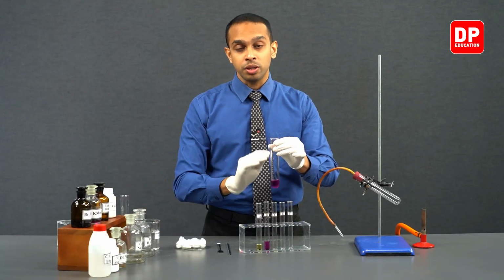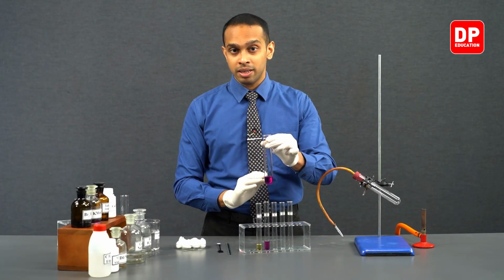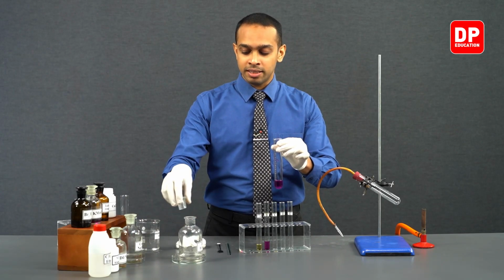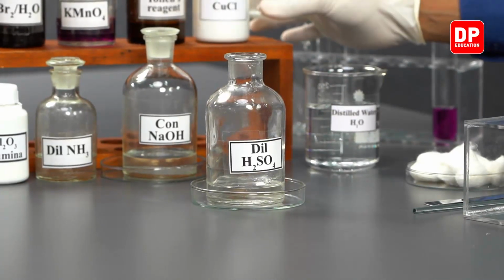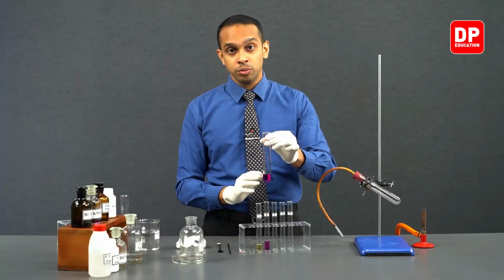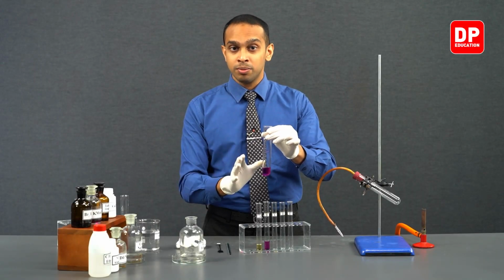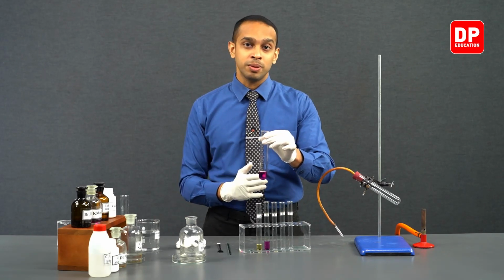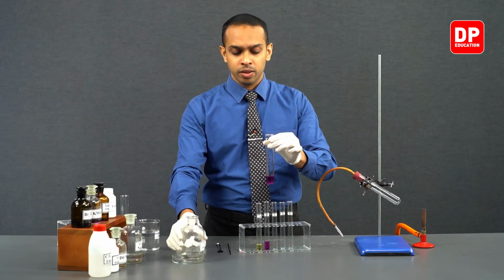And to this potassium permanganate solution, we are going to add sulfuric acid. The addition of sulfuric acid is going to make this potassium permanganate aqueous solution into an acidified potassium permanganate solution.